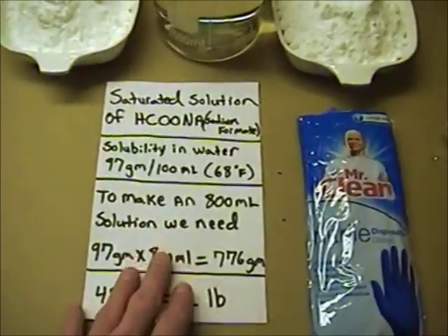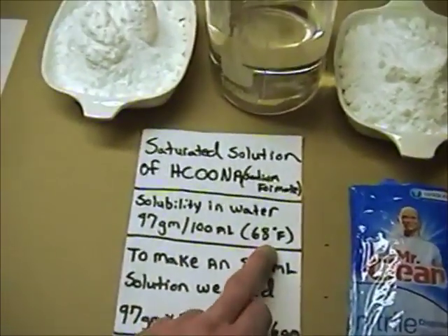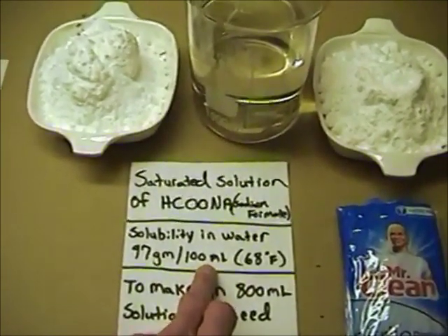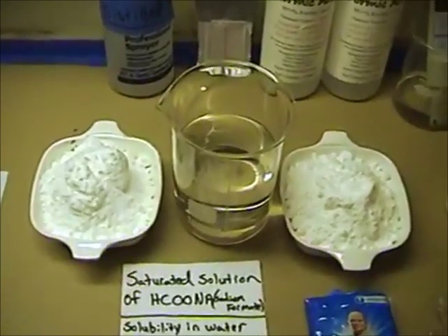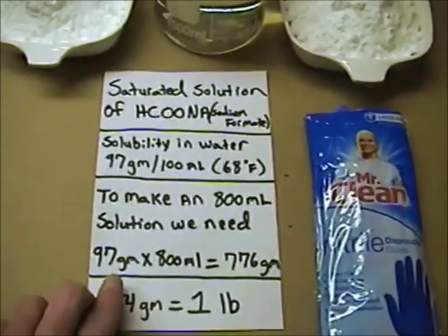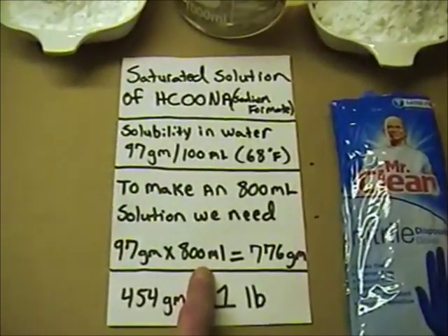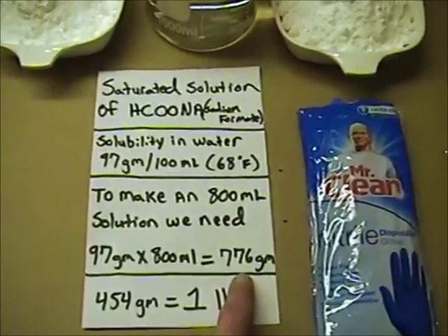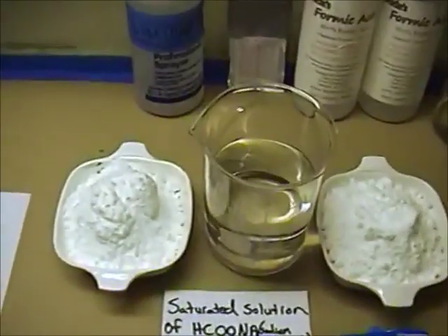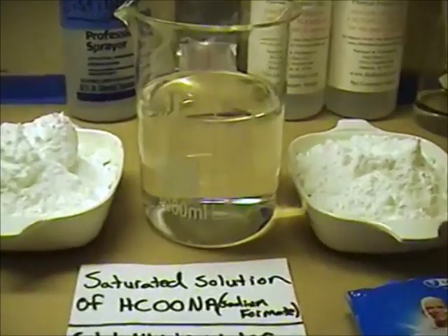So we have to use these numbers to give us a starting point right here. And we see that the solubility of sodium formate in water at room temperature, or about 68 degrees, is 97 grams per 100 milliliters. And what we're looking for here is a saturated solution of sodium formate. So, to make an 800 milliliter solution of sodium formate, we multiply 97 grams per 100 milliliters times the 800 milliliters we need, and that's 776 grams. Now, for reference, 454 grams is a pound. So this is about 1 3/4 pounds of sodium formate that will dissolve into this 800 milliliters of water.